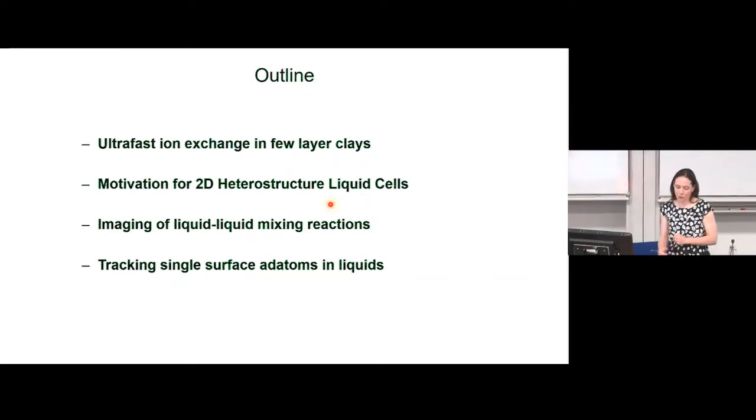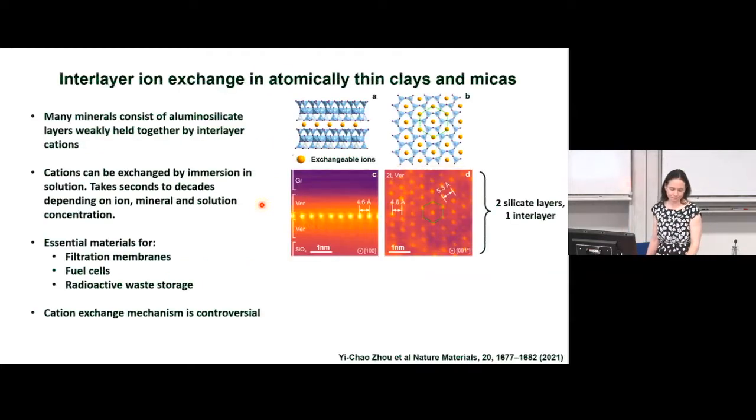The second part of the talk, I'm going to tell you about why it's difficult to do an experiment in liquid in an electron microscope. And then I'll tell you about some of the recent developments that we've done, allowing us to perform liquid-liquid mixing reactions. And as I said at the beginning, tracking single atoms moving around in a liquid environment on a solid surface. So this is the motivation for a liquid phase experiment.